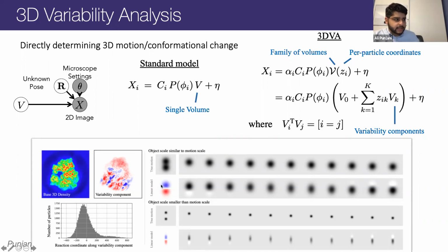So it's telling us that in order to generate all of these moved dots at different positions, we should start with the average of all the dots and add some amount of this positive and negative shape. And if we do that, what we get is right here in the bottom row, from left to right, generated versions of the actual data under the linear model.